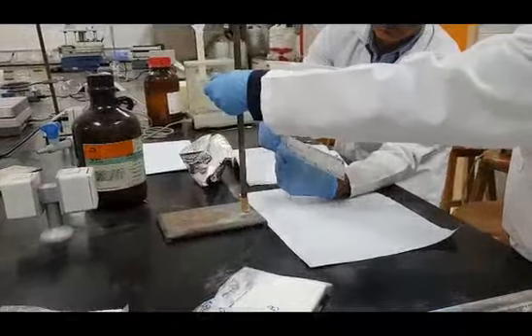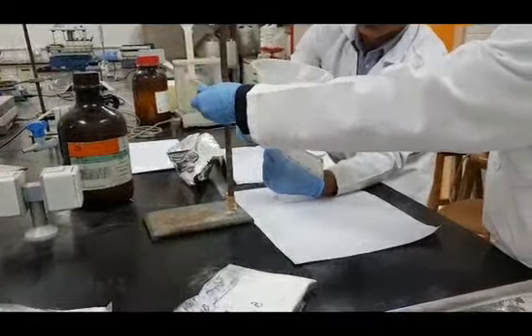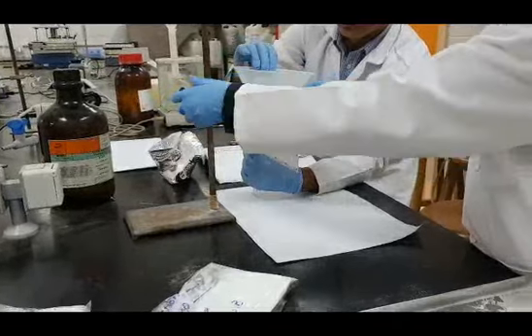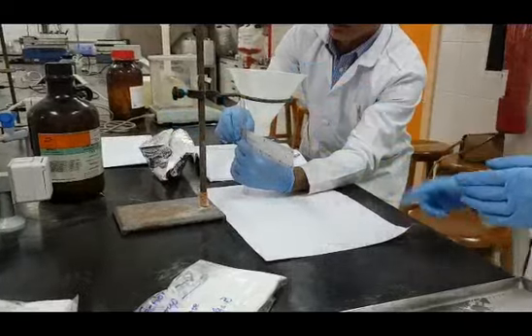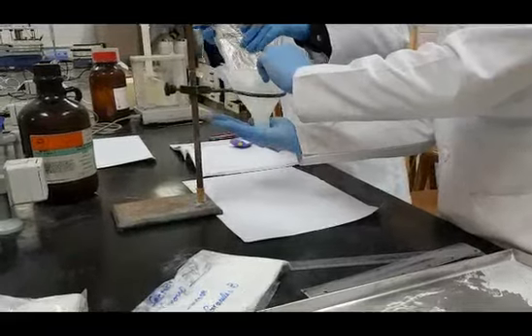Now, assemble the apparatus. As you can see, measure the funnel height using a ruler, and this height should be 15 centimeters and not less than 14 centimeters. This procedure requires only 2 students to perform.